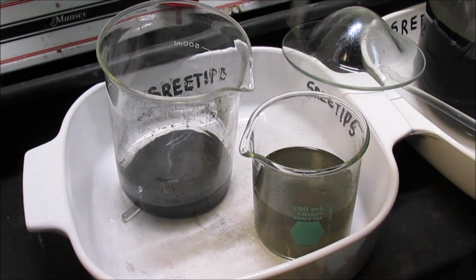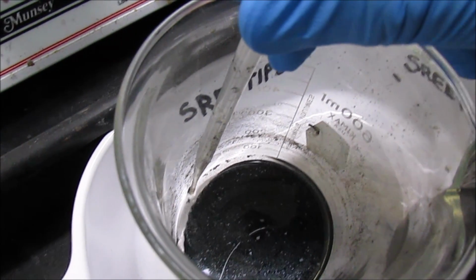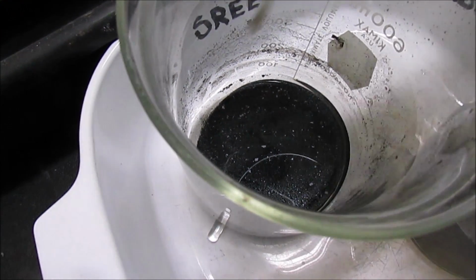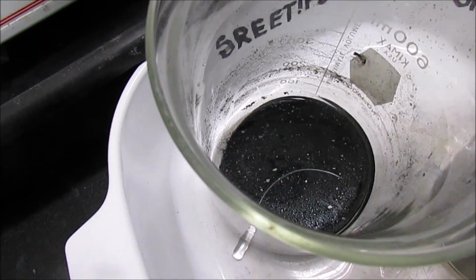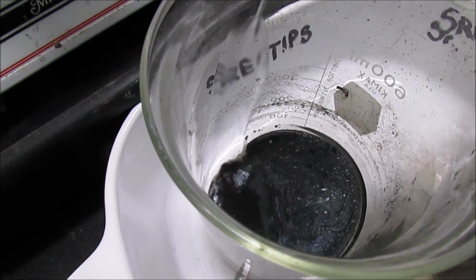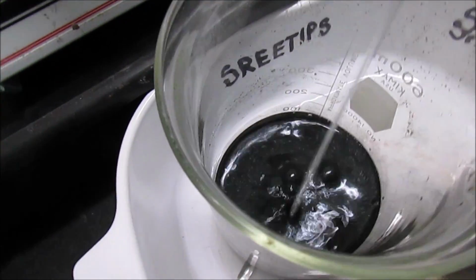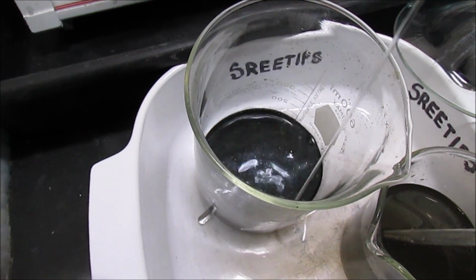All the liquid that I can draw off of here. Draw enough, I'm starting to get solids going up in the pipette there. So now what I'll do is add some distilled water to get this solution diluted down, and then we'll just let this settle out.